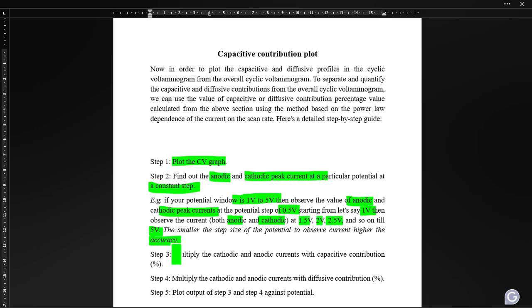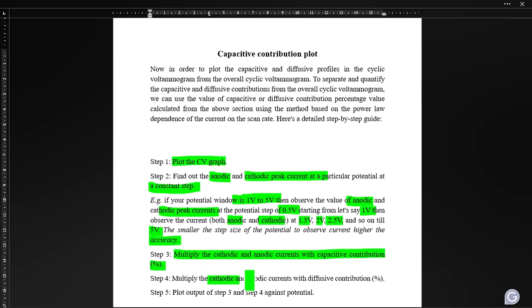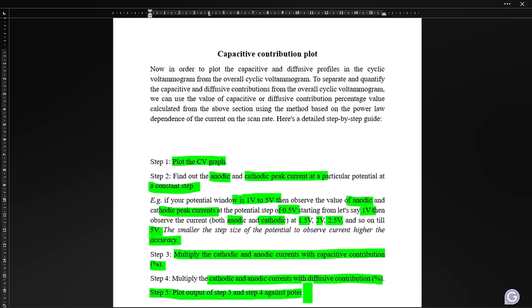Third, multiply the anodic and cathodic currents by the capacitive contribution percentage — this value was calculated and covered in the previous video. If you have not watched it, you can calculate the capacitive and diffusive profiles separately from the overall cyclic voltammogram. Fourth, multiply the anodic and cathodic currents by the diffusion contribution percentage. Fifth and finally, plot the outputs from steps 3 and 4 against potential.